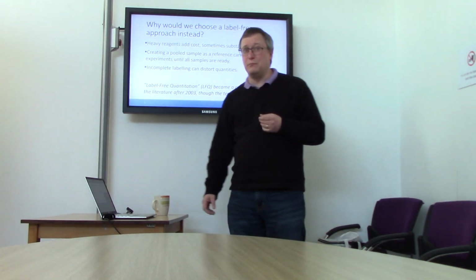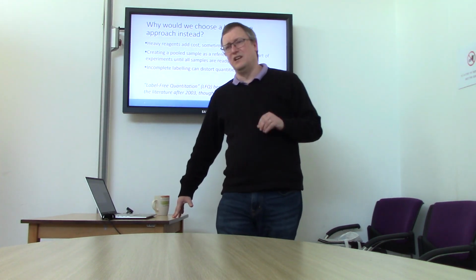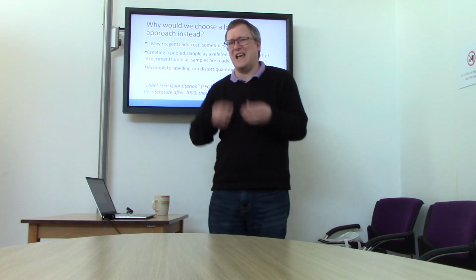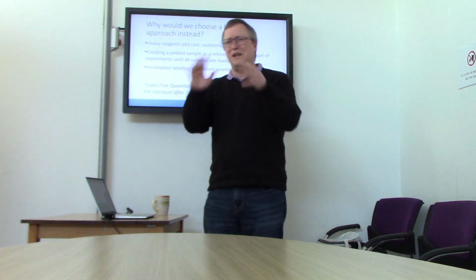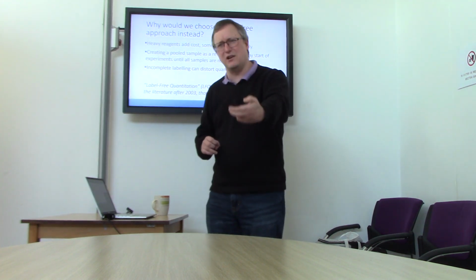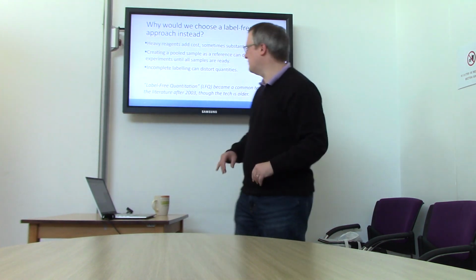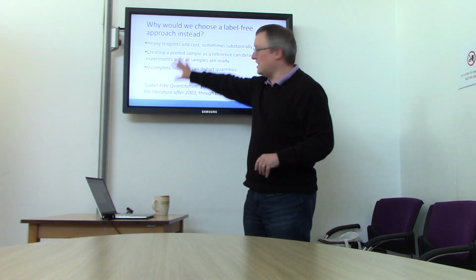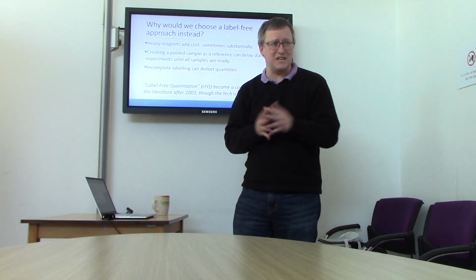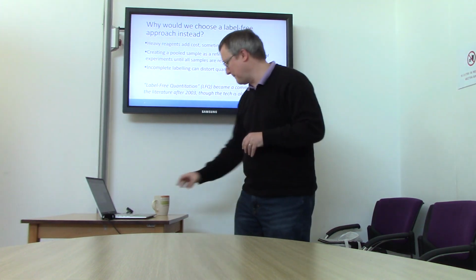And certainly incomplete labeling is a very big deal. What if only 90% of the lysines in a sample have been heavy labeled? That's going to create all kinds of havoc with the relative enrichments. The heavy sample by itself would already appear to have some light sample in it. So that's kind of a mess. So these have led to people really emphasizing label-free quantitation as the means for comparing samples via proteomics.